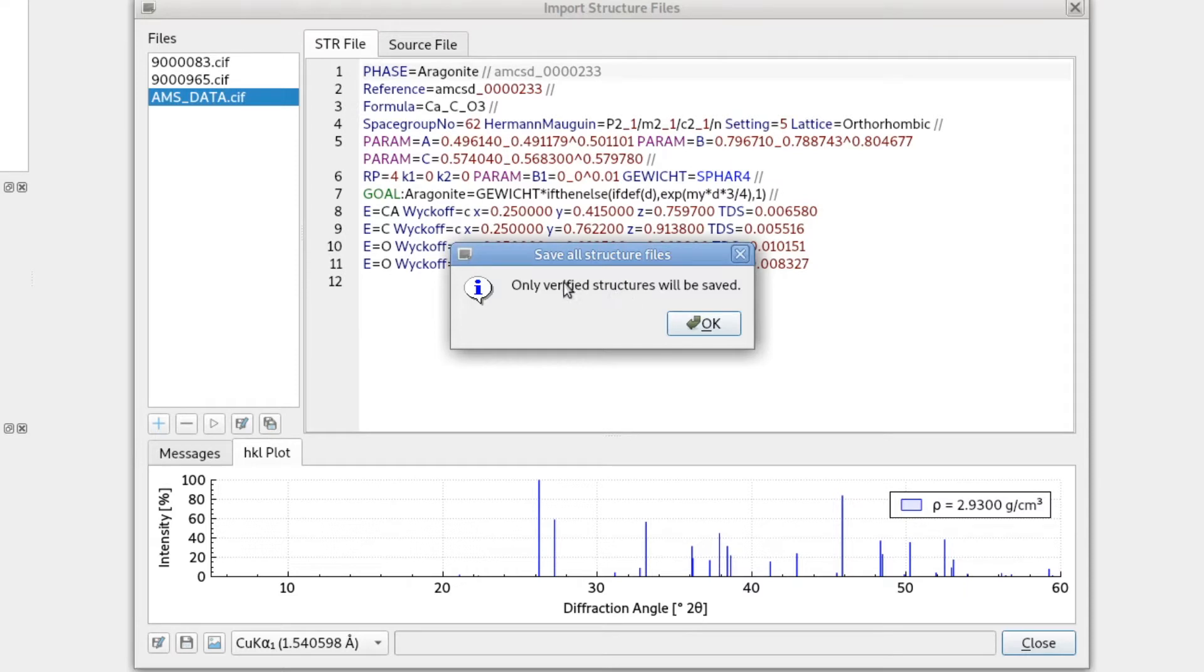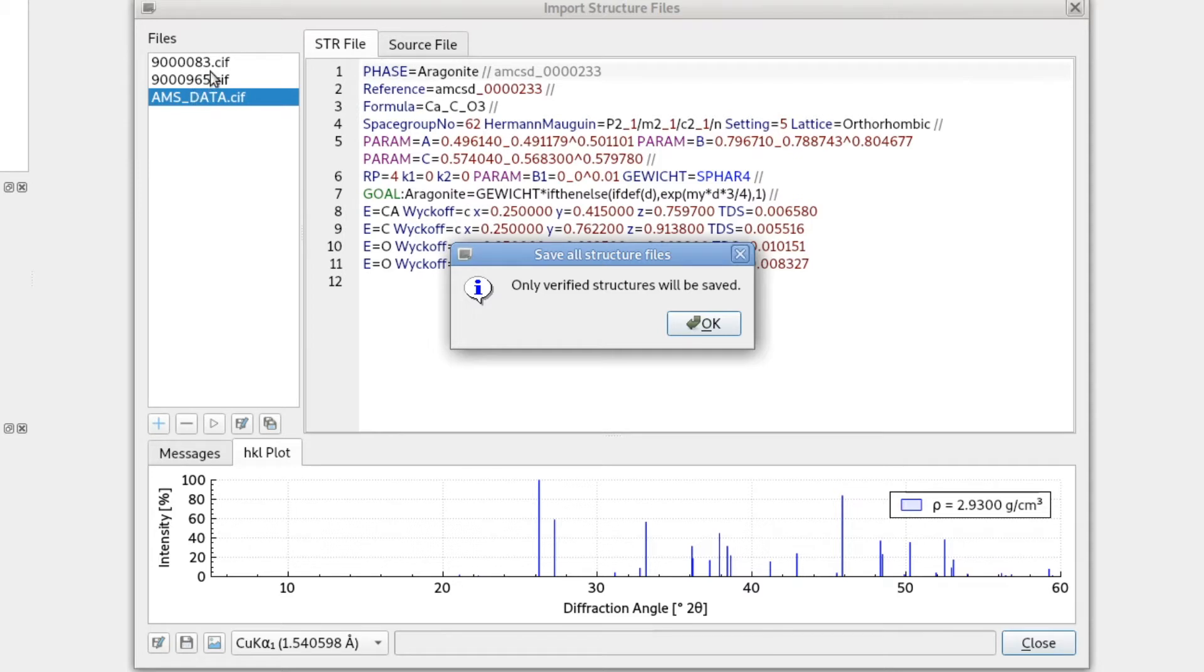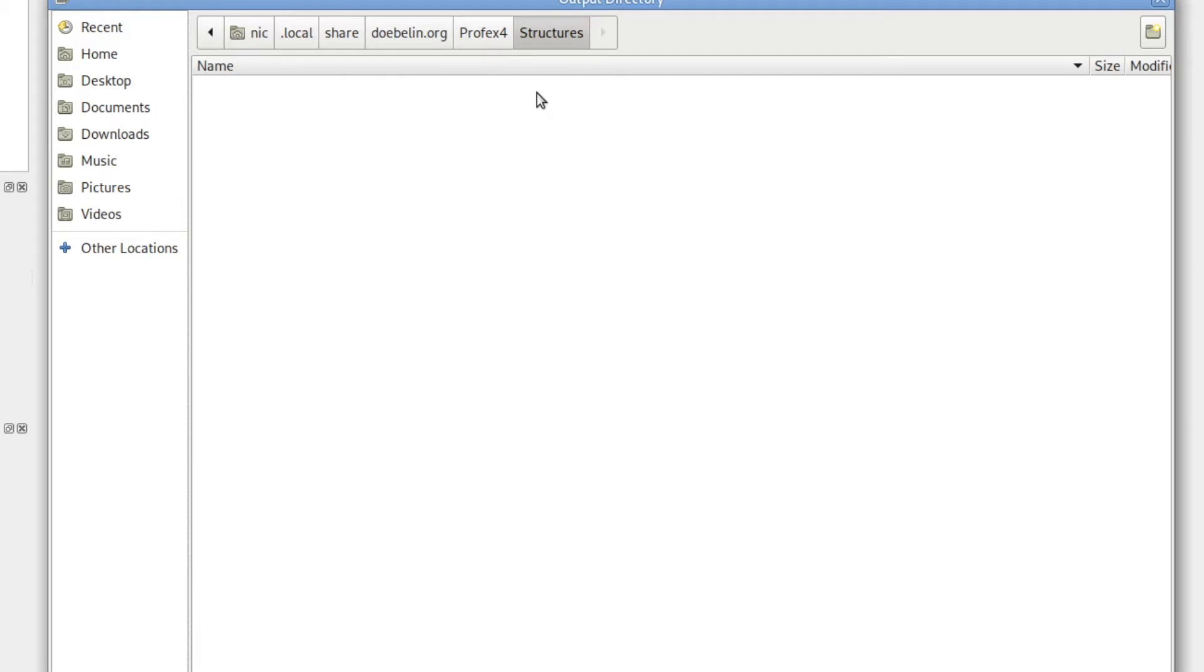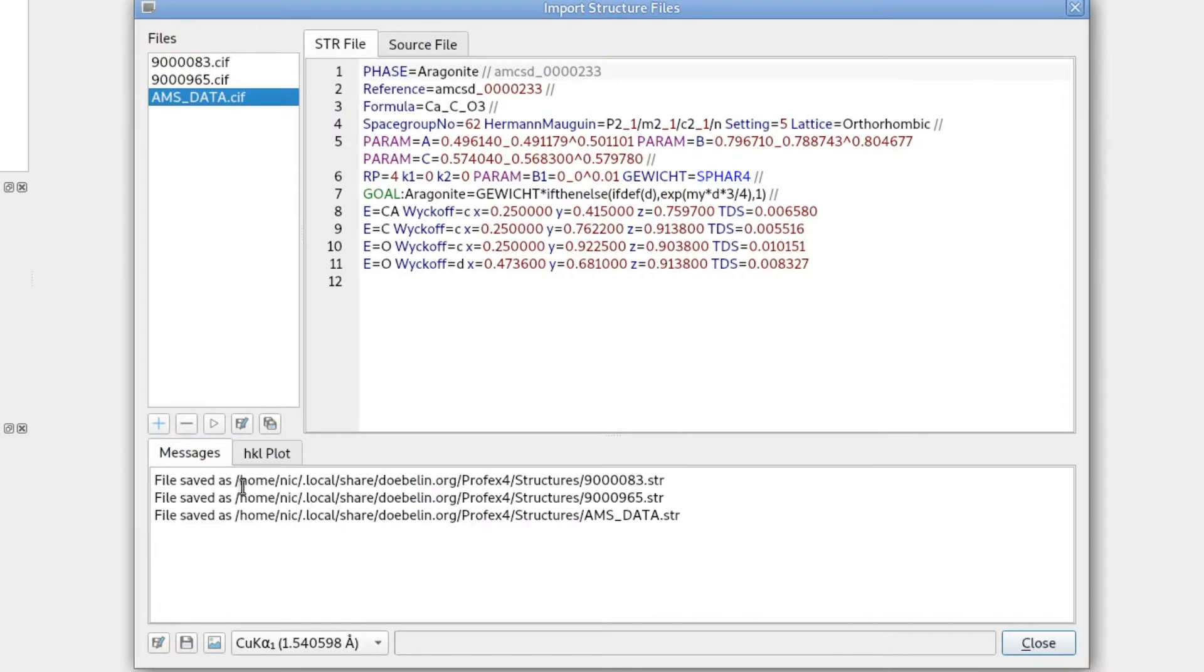So if we do this, it will warn us that only verified structure files will be saved. So if there were still files that either failed verification or we just forgot to verify yet, these will be skipped. So only if verification was successful, they will be saved. So we click OK. We can select the directory where to save them and click Open. And now it will tell us that all three files were saved at this position.